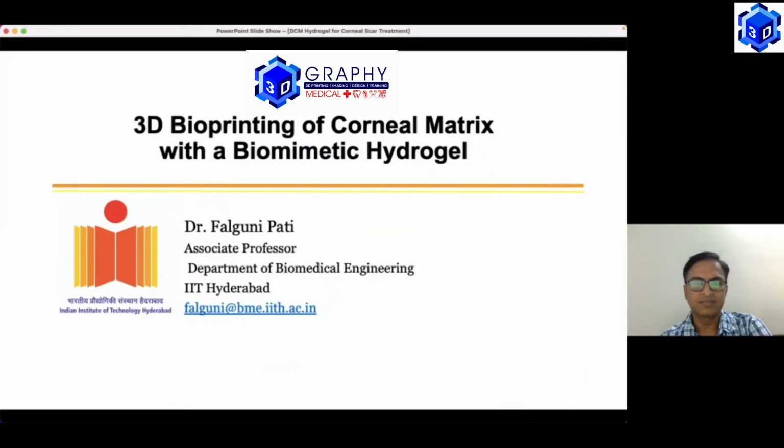Good morning, everyone. Thank you very much, Dr. Siru, for providing the opportunity to present our work. Today I'm going to talk about one such work that has reached a certain stage where we are now going into preclinical and clinical studies. The topic is 3D bioprinting of corneal matrix with a biomimetic hydrogel.